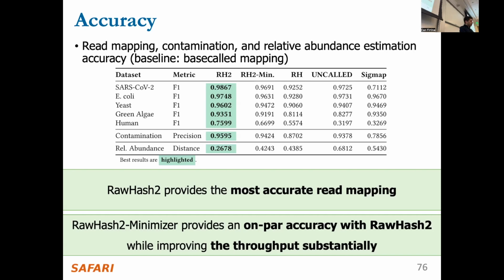So that's one thing. The second thing is, of course, we can keep improving the quantization mechanism, so the hash value that we're generating is more accurate, and some of these wrong matches in the repetitive regions are eliminated. That's the second approach that I think we could take.